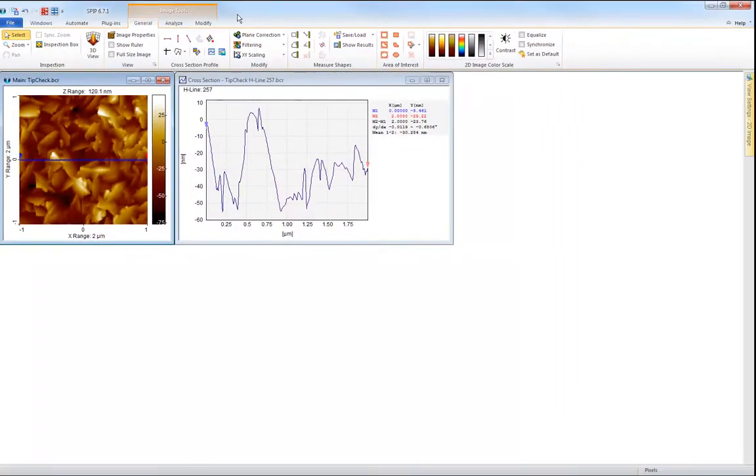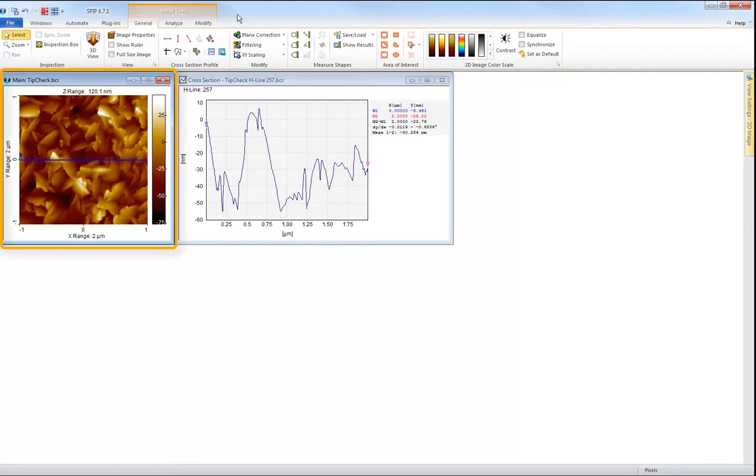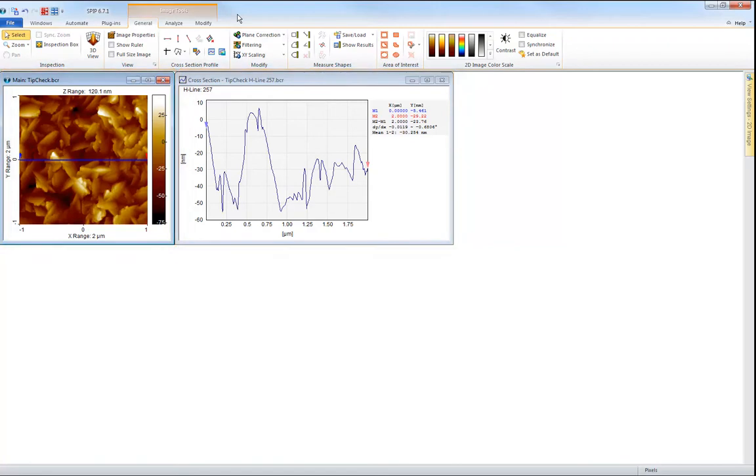SPIP is a ribbon based software. Data, that is images, force curves, profiles and so on, are displayed in individual window frames. At any time the ribbon tabs available will adapt to the data type inside the window currently selected. This makes it easy to find the relevant tools.